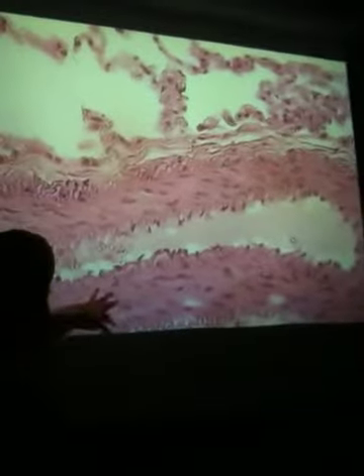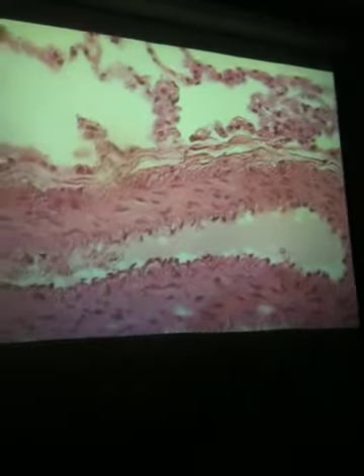That one's real clear — you can see the big media. So we're finding lots of arteries, as always, struggling to find veins. You do indeed have them, I promise. There's a nice vein. You can see how thin the media is, and there's no lamina. So that's what we're looking for.